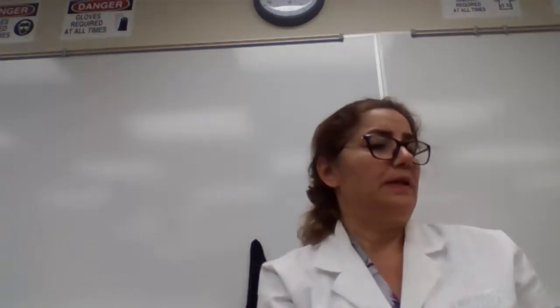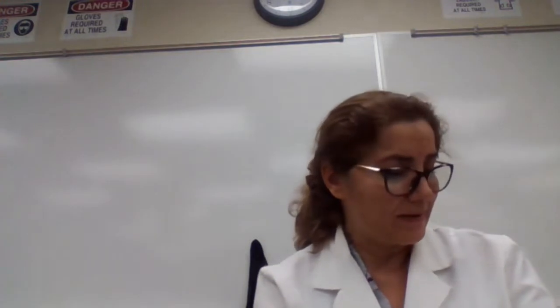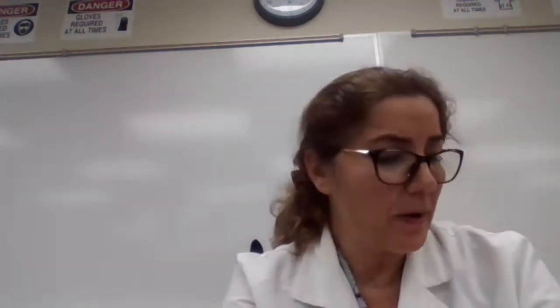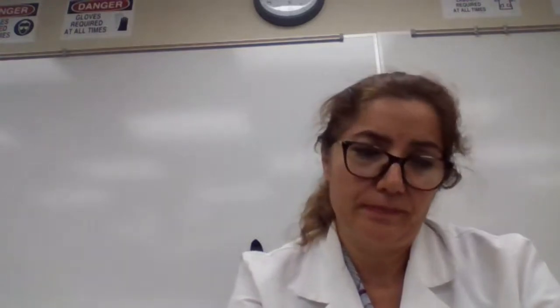Okay. The next test would be the chromic acid test. Can you tell me, if the chromic acid test is positive, what is the conclusion?